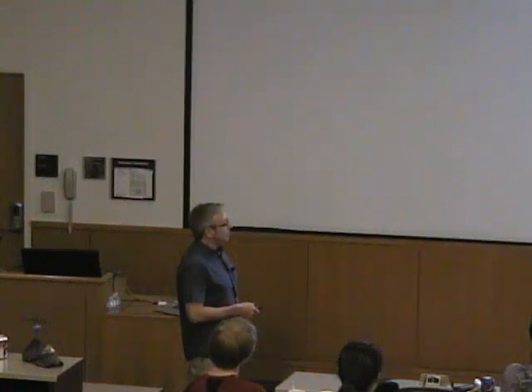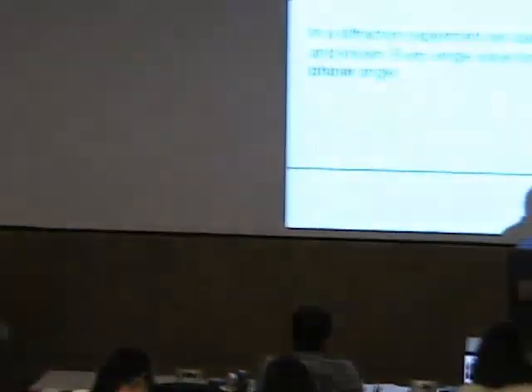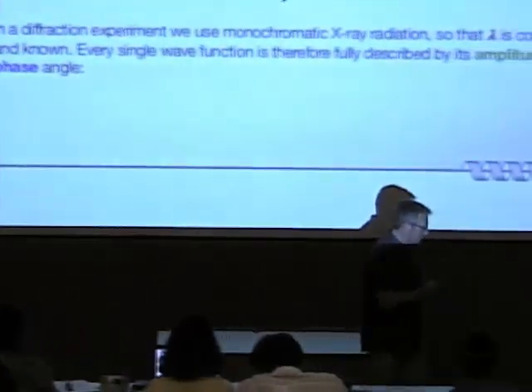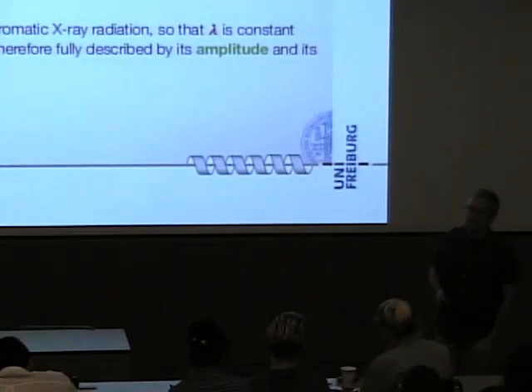Now, what we do for various reasons is that we're using monochromatic X-rays. And that is extremely helpful because it means that whatever we have has the same wavelength. We're looking at elastic scattering. Elastic scattering does not change amplitudes. Well, actually it changes the phase angle by 180 degrees, but that's not much of a problem. But it does not change the energy. It does not change the wavelength that we have.